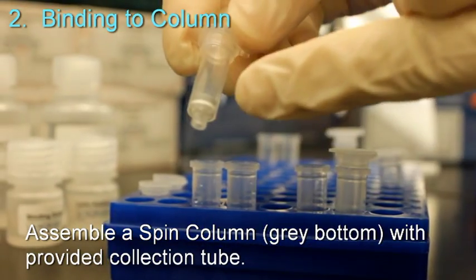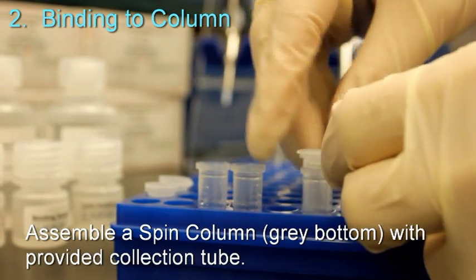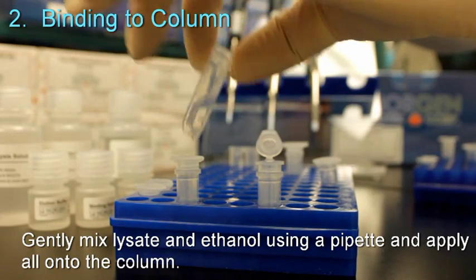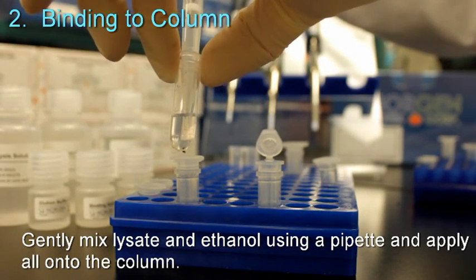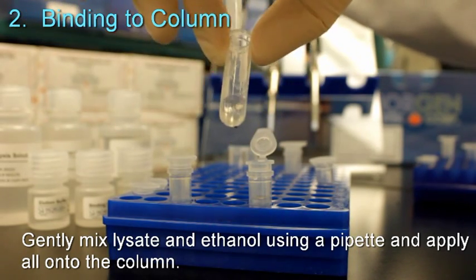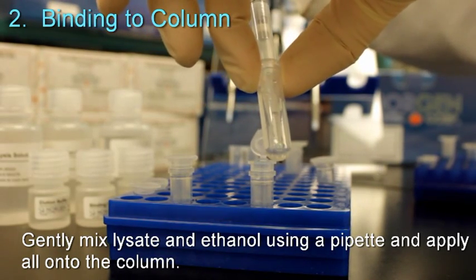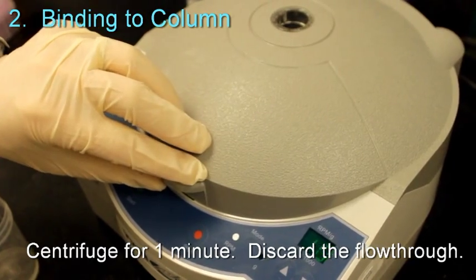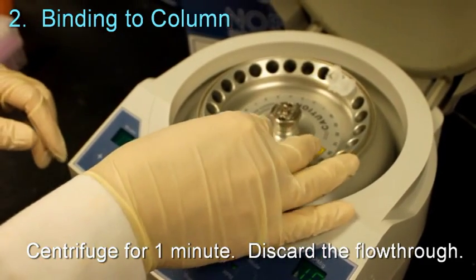Assemble a spin column with a grey bottom with the provided collection tube. Gently mix the lysate and ethanol using a pipette and apply all onto the column. Centrifuge for 1 minute and discard the flow-through.